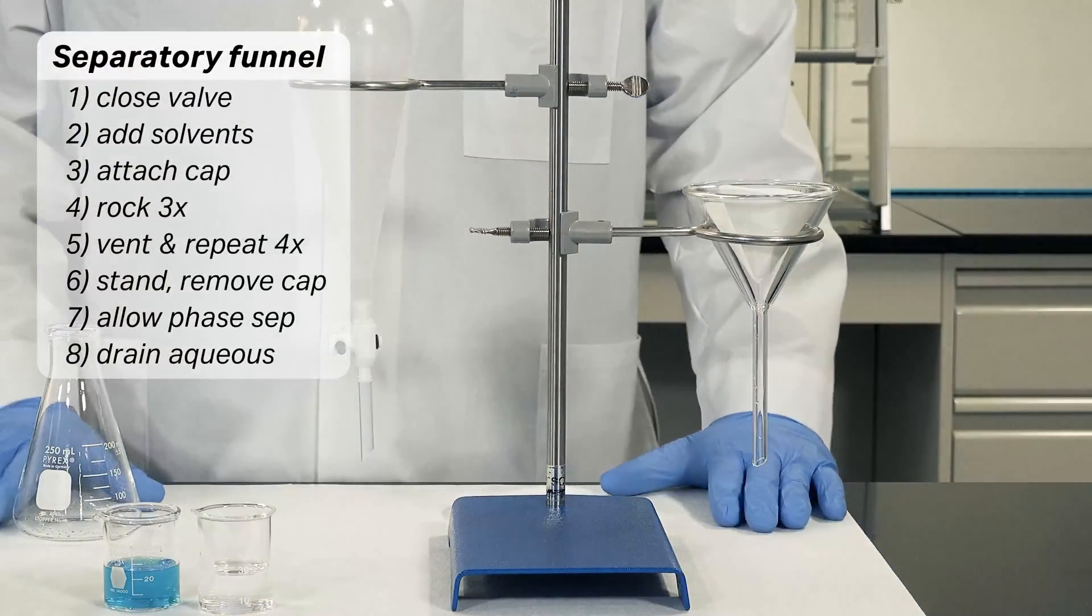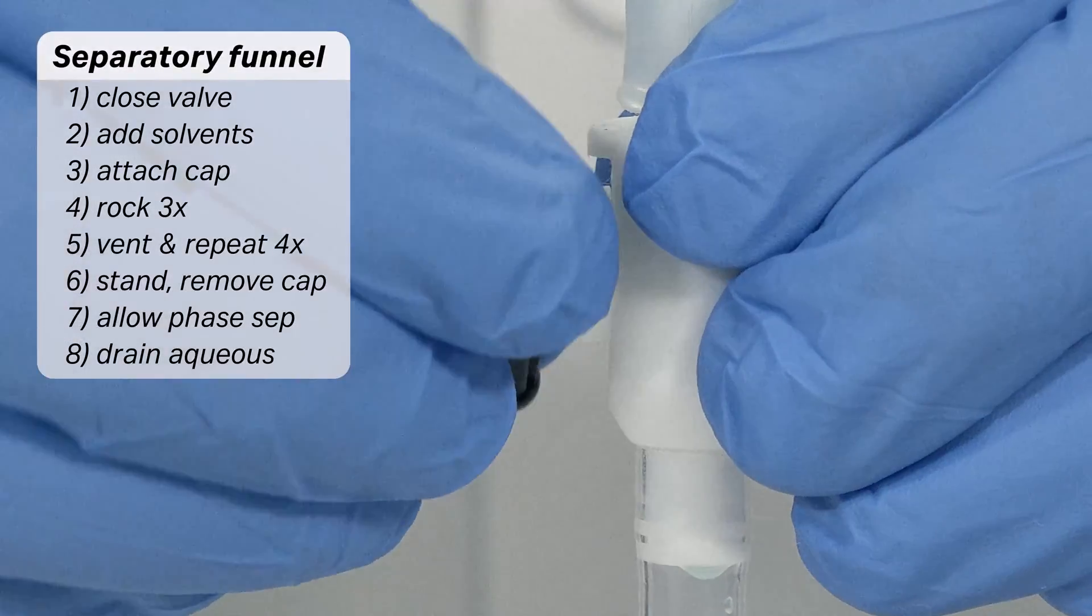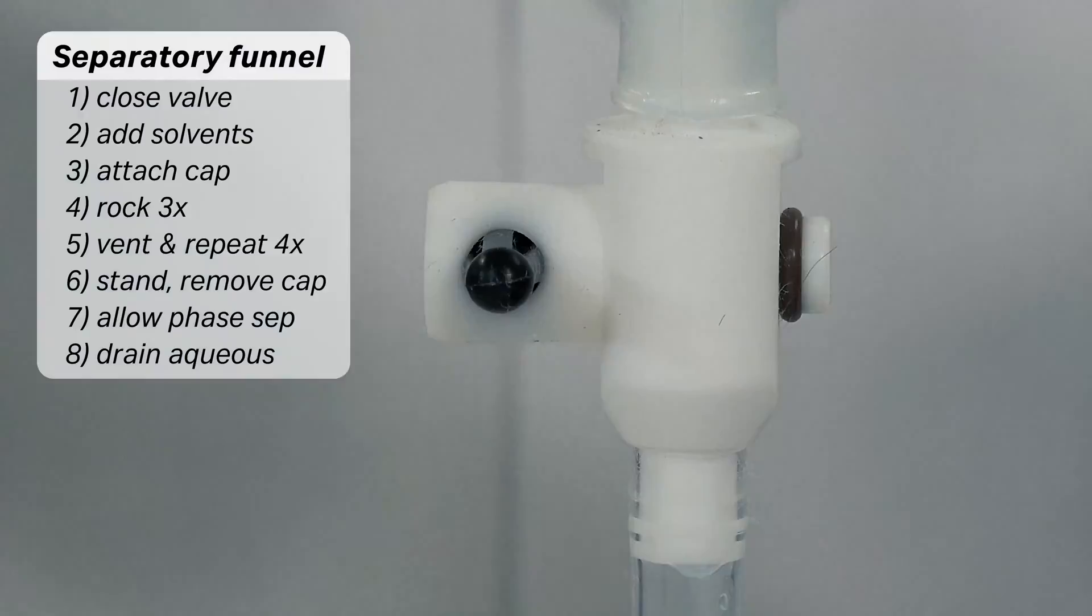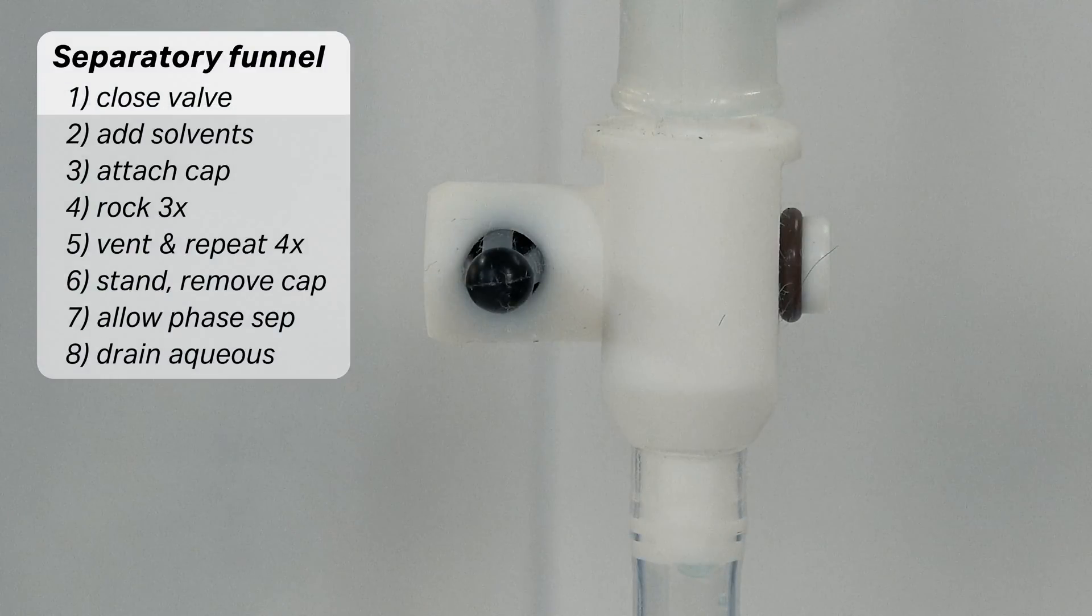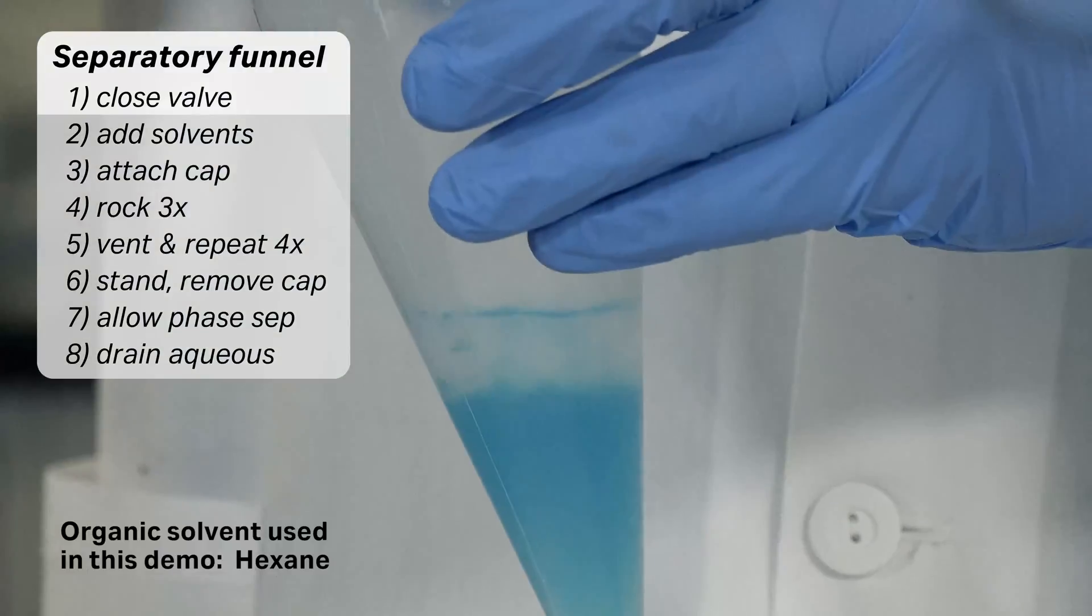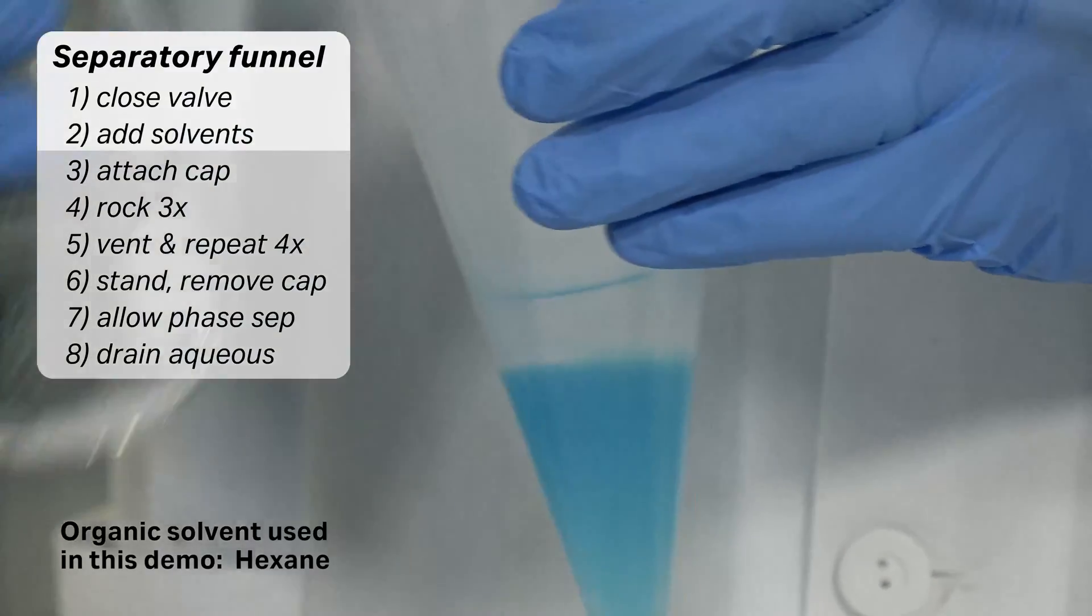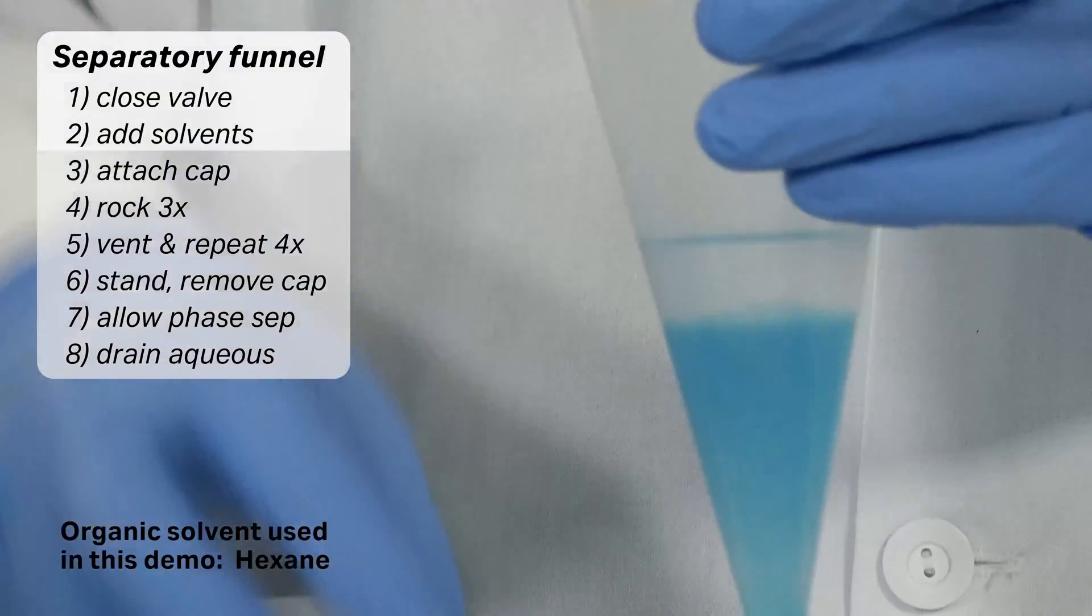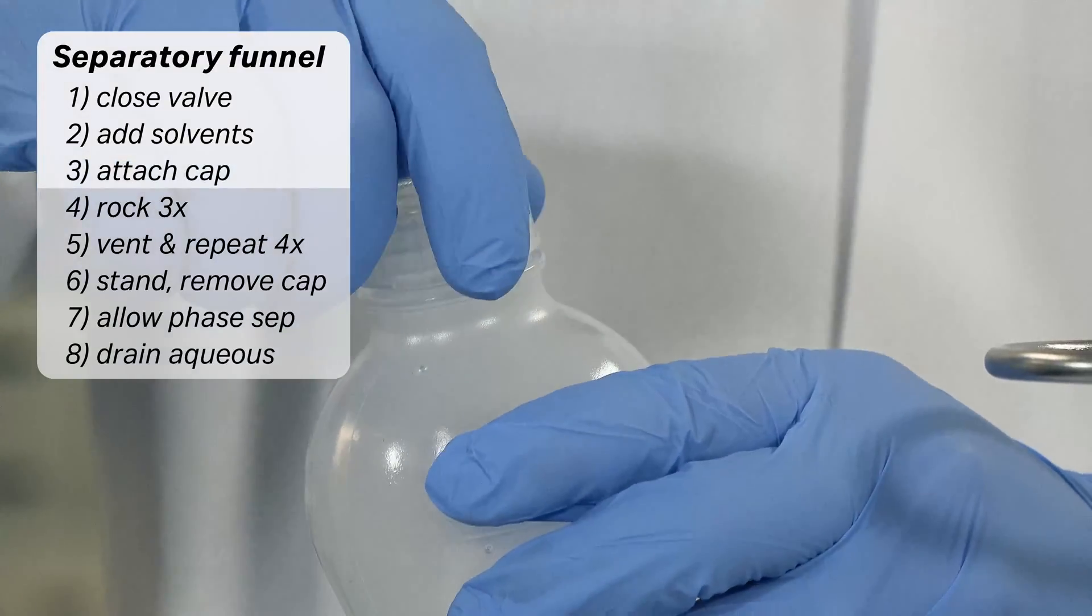First, let's use the standard separatory funnel. Ensure the valve on the separatory funnel is in the closed position. Add equal amounts of an aqueous and organic solvent to the separatory funnel. Attach the cap on the separatory funnel.